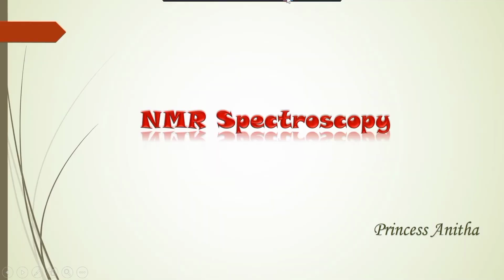Friends, in this video let us understand about NMR, Nuclear Magnetic Resonance Spectroscopy. What is NMR and why it is important? NMR is mostly used in organic chemistry to identify the structure of unknown molecules.